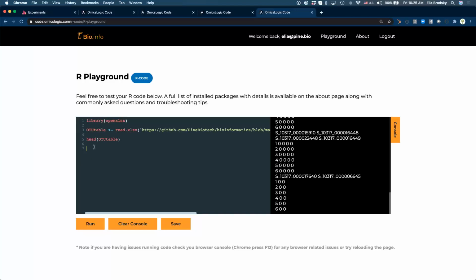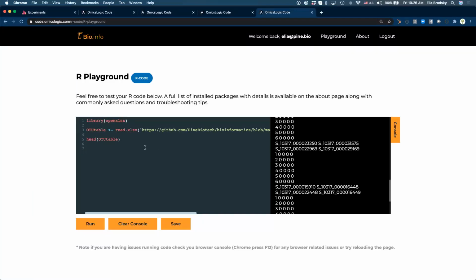All right, so the next thing that we want to do is store the names of our types of OTUs by phylum, right? If you look in this table, you can see that it's going to include the name. So let's put that into, Gregory, were you able to get it to work?